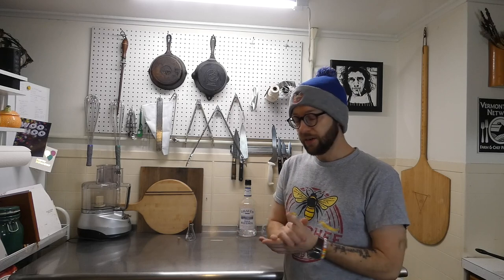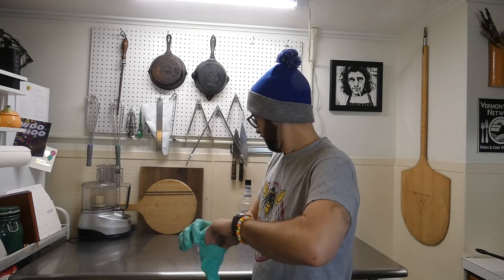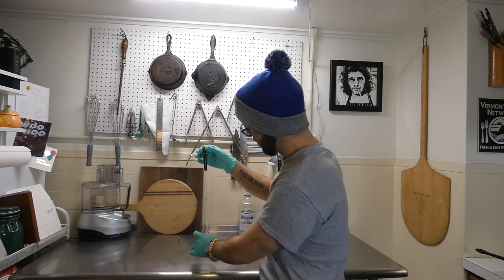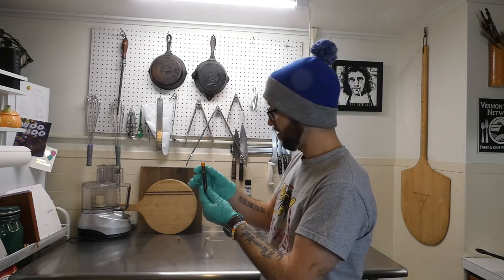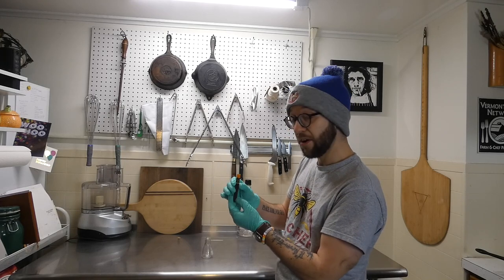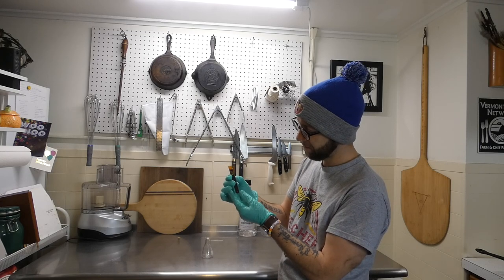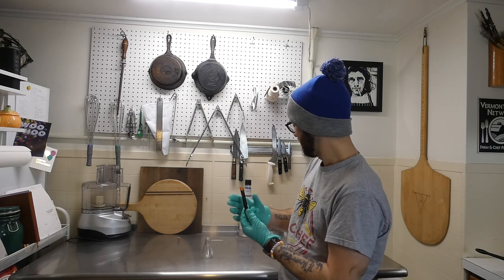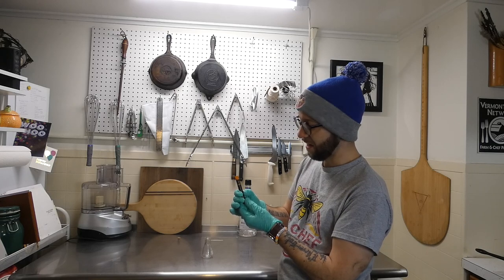So, yeah. All right, so I'm sure most of you want to see me taste this, so I'll taste it. I'm gonna put gloves back on though, just in case. So, before I taste it, this is about a 5 milliliter test tube here, and it filled it almost to the top. So we ended up with a little under 5 milliliters of the capsaicin extract. Better than I thought it would be, honestly, because I didn't think I had a lot of peppers to make this much. This will last years. Like, I really don't think I'm gonna be using much of this ever. I just wanted to do this as a fun little experiment. I may make some candies with this, possibly.